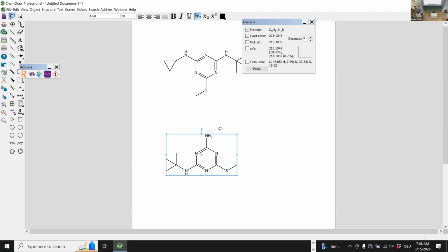So, okay, that brings me to the last thing. So what do you think should be now the next step if I say, okay, this is a cool example. Okay, we may have to redo the scaling and TIC normalization to check box plots and significance in the app. But if I want to follow up on that, what would be the next steps that you would do if this was your study and you want to write this in your paper?